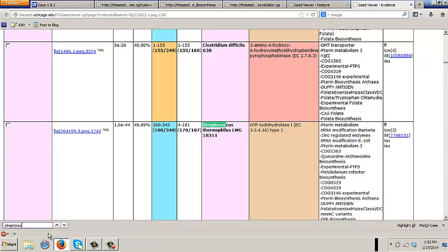Do you follow? And if you're confused, you can click on this little icon of alignment and it would throw you back and try to position you, this is the Streptococcus we were looking at. Okay, we can go here. Okay. And there are many ways to show the same thing. So these numbers, if you look carefully at them, try to convey which part of the query and which part of the target are actually aligned. And the color does the same.